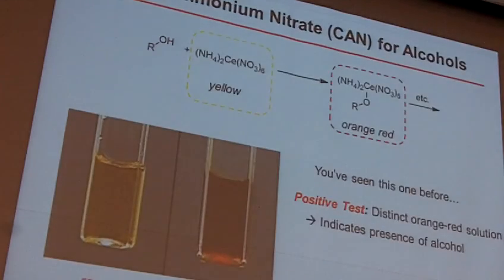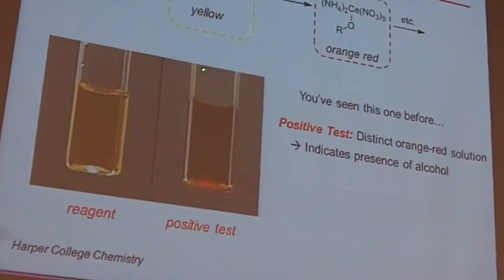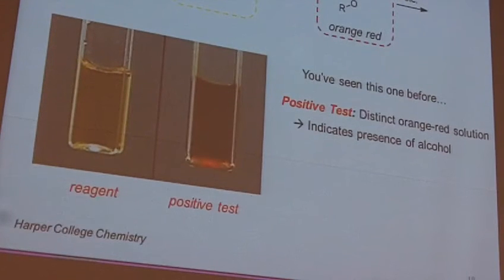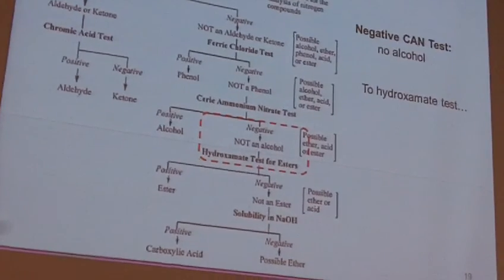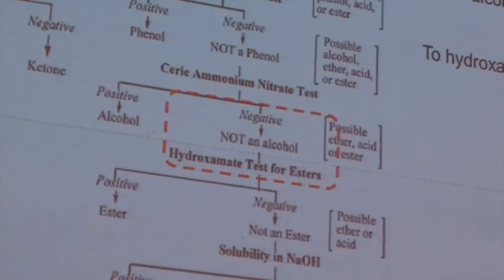And again, this is one you've seen. We've got that yellowish, we turn this red color. That's a positive for the alcohol. And we can go from there. Not going to hit too much on ones that we've seen before.